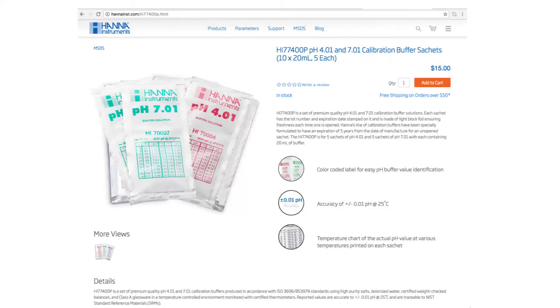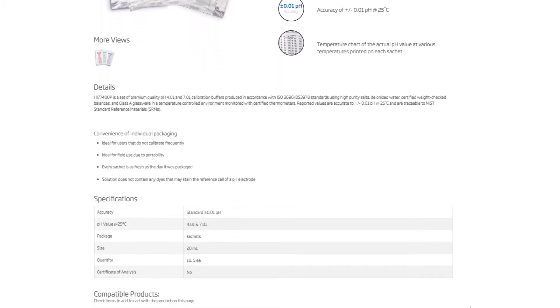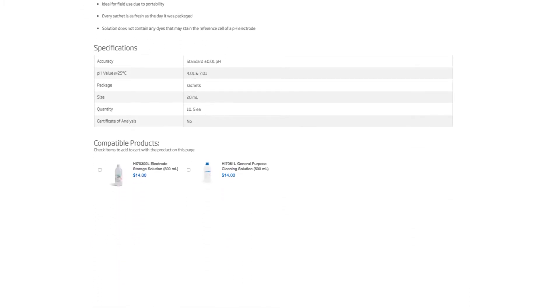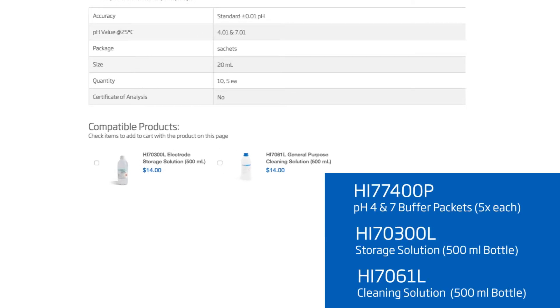For this meter, we recommend the HI77400P calibration set, the HI70300 storage solution, and the HI7061 cleaning solution.